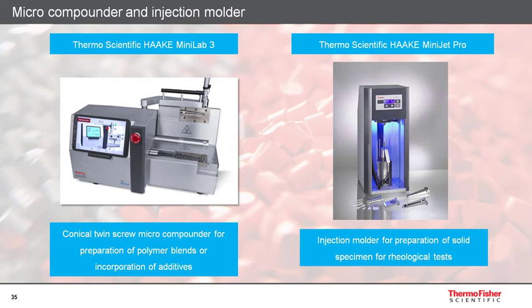When a sample is passing through the flow channel, the resulting pressure drop can be used to calculate an apparent shear stress. From the selected screw speed and the measured back pressure, an apparent shear rate can be obtained. The shear stress and the shear rate values can be used to calculate the relative sample viscosity at different screw speeds. This principle enables determining the shear thinning behavior of polymer melts.